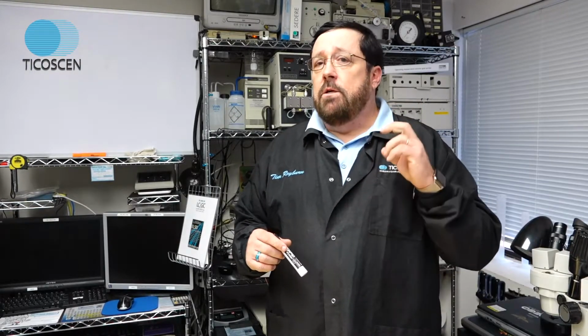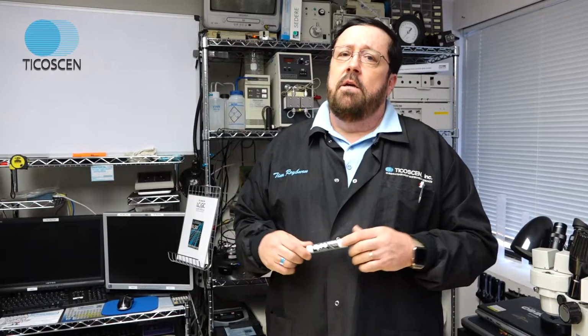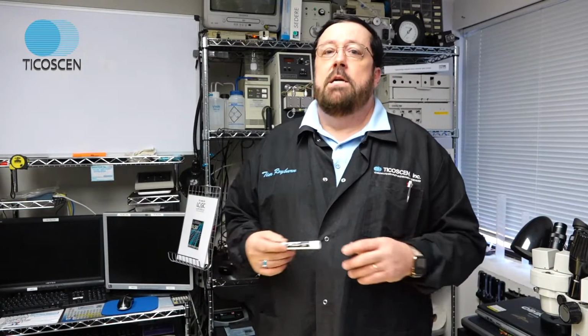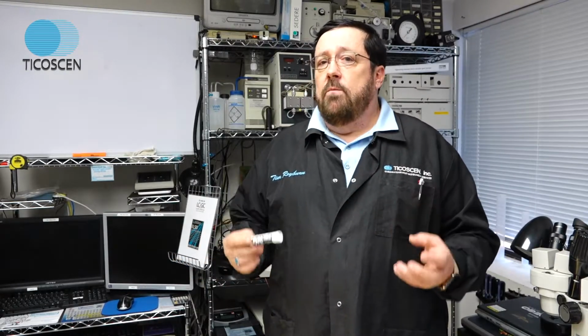Some people will run salts in their samples to control the pH, to keep their molecules in a nice, stable environment. But they'll use salts as a buffer. You don't want to use non-volatile salts. You want to use volatile buffers like trifluoroacetic acid, TFA. It's a pretty common way to change the pH of your mobile phase or your samples without using a salt. Because the problem with salts is that when they come out of solution and you evaporate and dry them, they turn into a crystal. And what does that do?